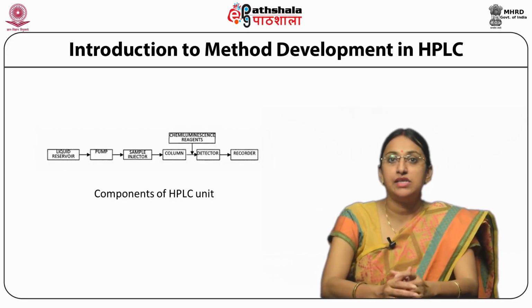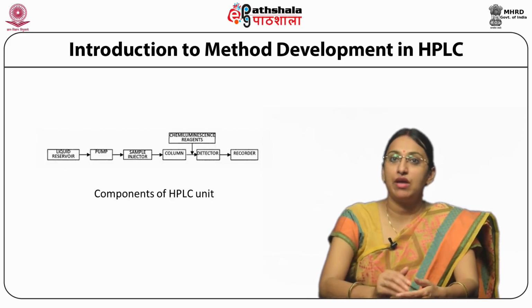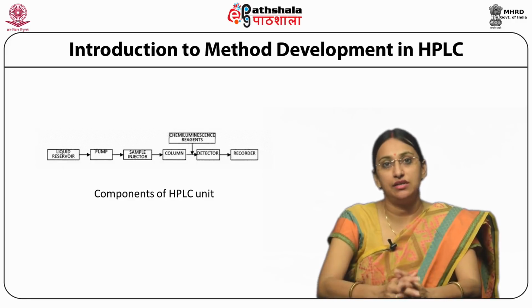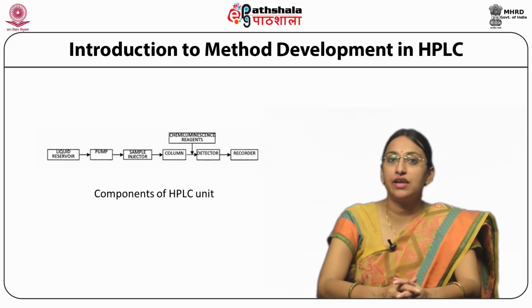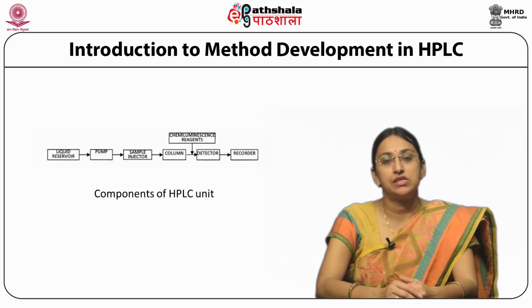Method development is largely done to support drug testing against specifications during manufacturing and quality release operations, as well as during long-term stability studies. Along with this, methods that support safety and characterization studies or evaluations of drug performance are also to be evaluated.